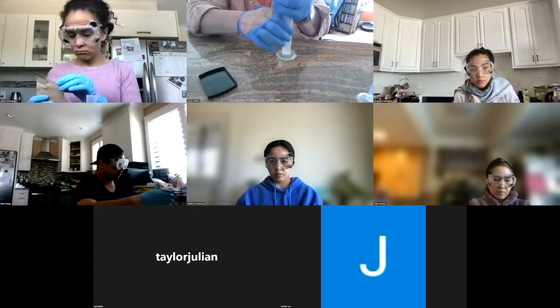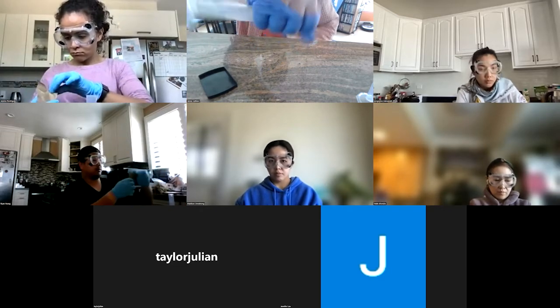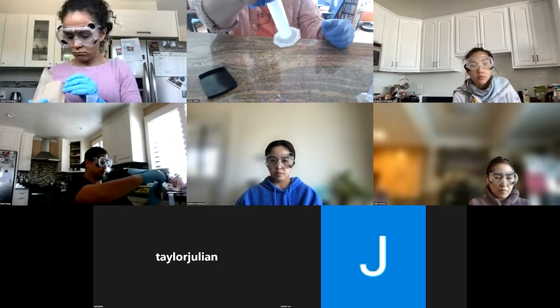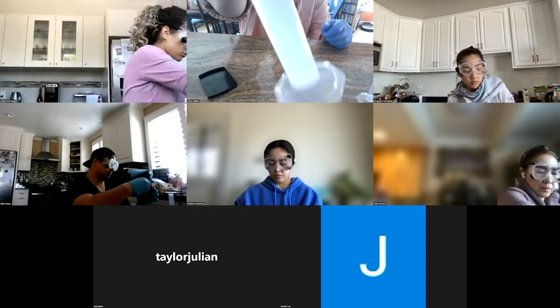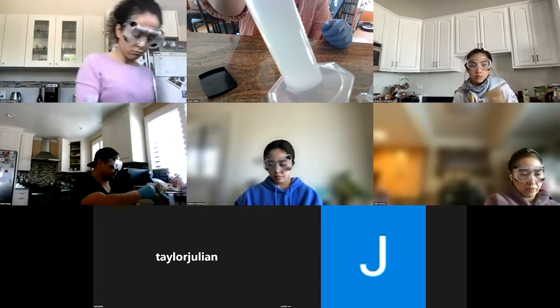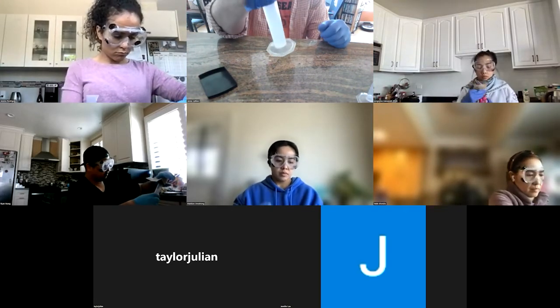Make sure you've got it good and tight. You can see there's lots of floaty bits in here, so it might take a minute to get this all dissolved.